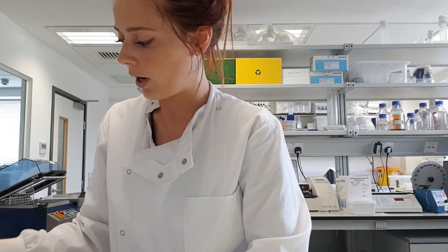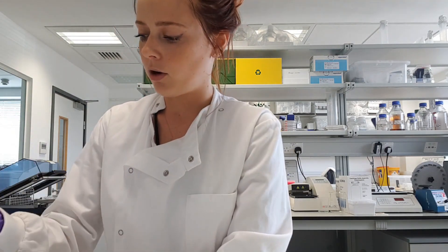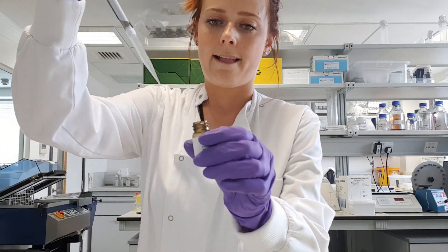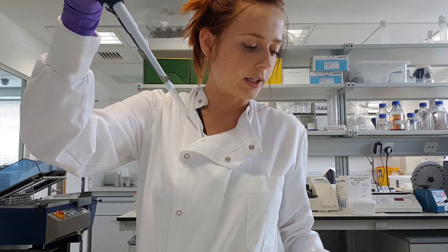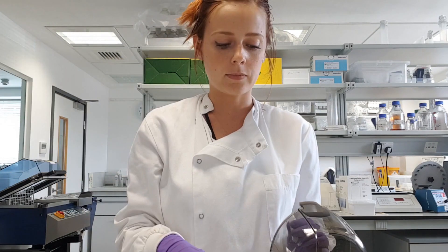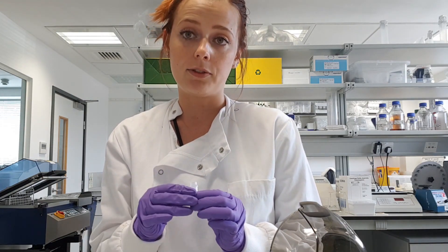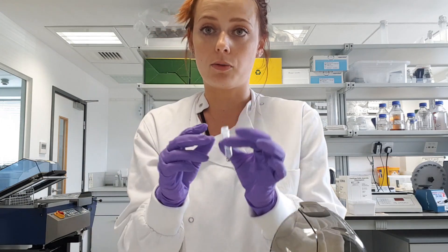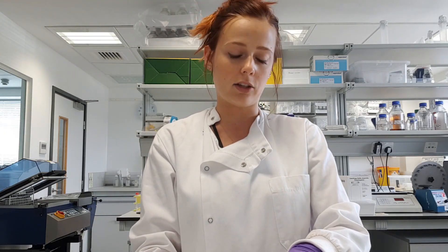The column should not dry out, so go straight away to the next step, which is to add 250 microlitres of PBS — the PBS provided in the kit — on the top of the column. Then centrifuge for 10 seconds at a really low speed of 50 G. You don't need to put a cap on the column; you can just centrifuge it as is for 10 seconds.